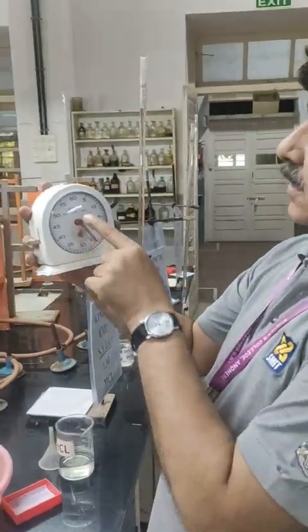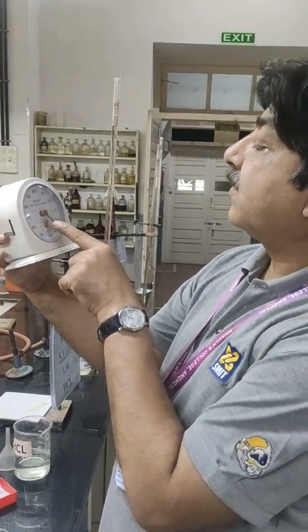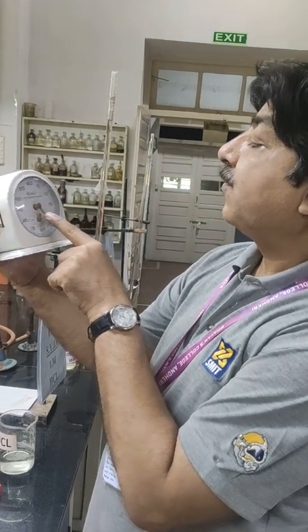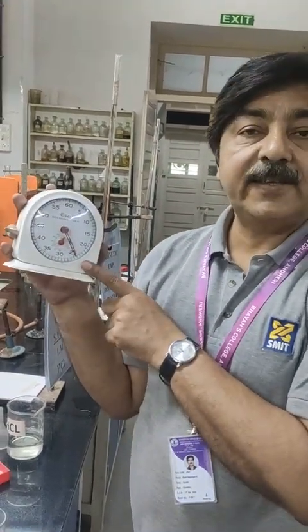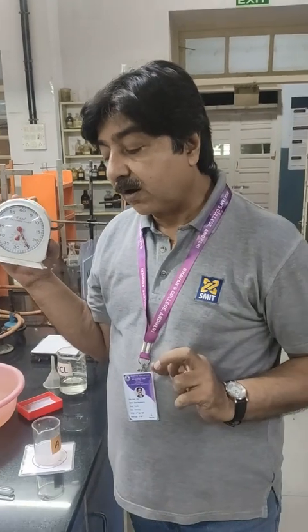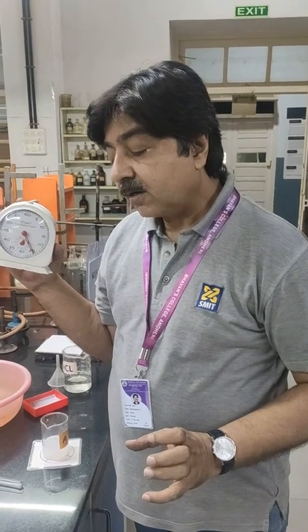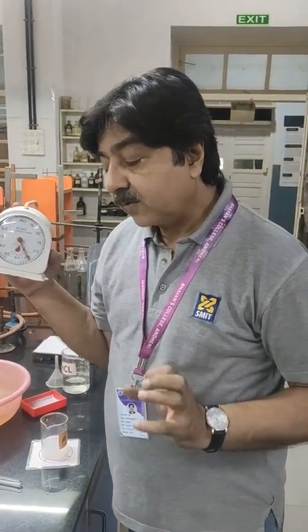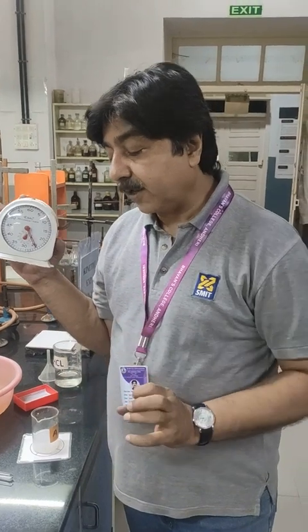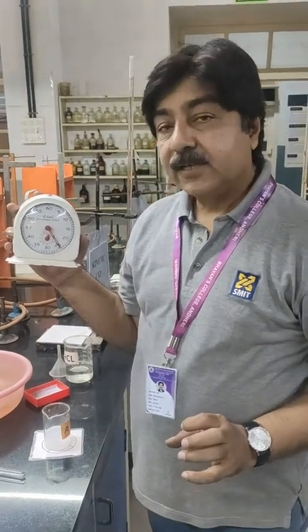You can see the big arm is on 25 and this small arm has covered 4, meaning 4 minutes and 25 seconds time was taken for this reading when we mixed 20 ml of sodium thiosulfate solution with 28 ml of water and 2 ml of 1 molar HCl. The total reactant mixture volume amounts to 28 plus 2, 30, plus 20, 50 ml. So the effective concentration of sodium thiosulfate in this solution is 0.04 molar.